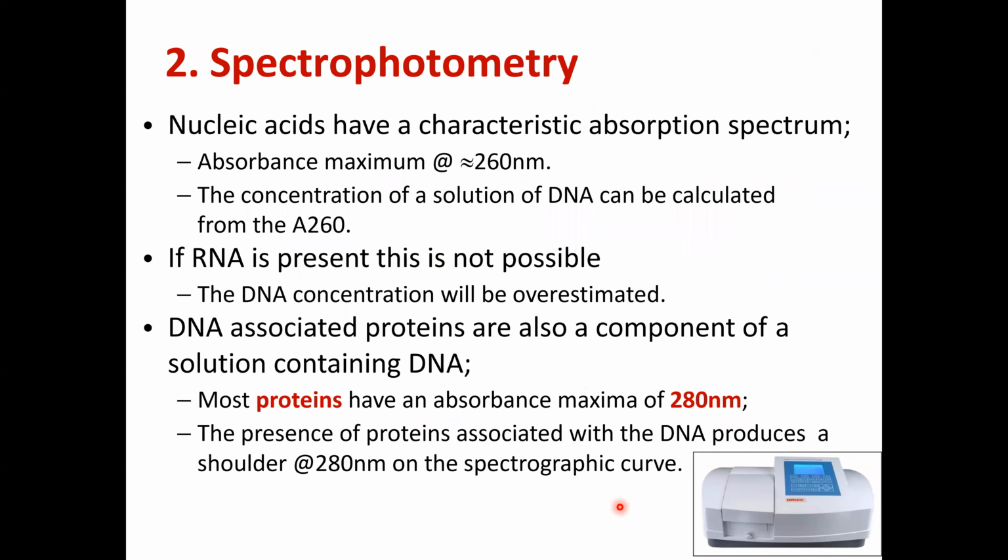Another method is spectrophotometry. I know you are already familiar with spectrophotometry because we already discussed this, especially in our clinical chemistry class. It is already familiar to you.